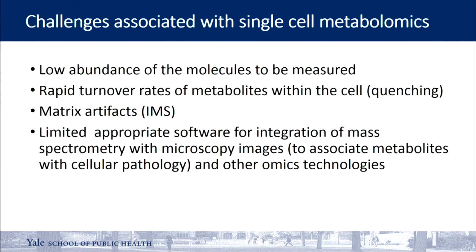So, challenges associated with single-cell metabolomics. As I said, low abundance of molecules to be measured. Rapid turnover rates of metabolites within the cell. This can be addressed by quenching, stopping essentially all the processes. Matrix artifacts. You have several types.